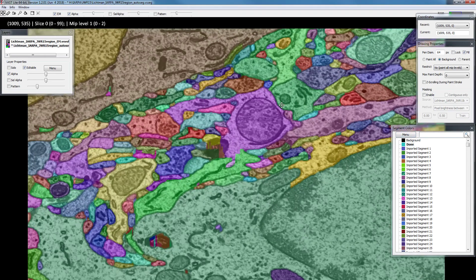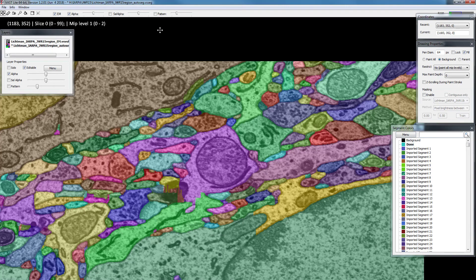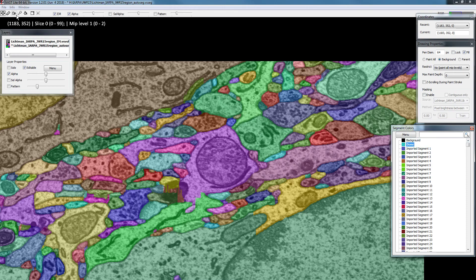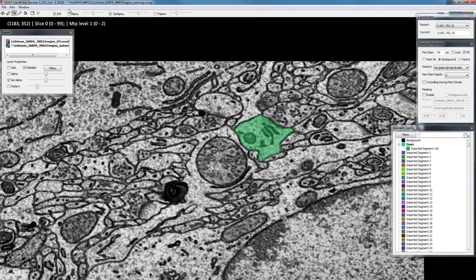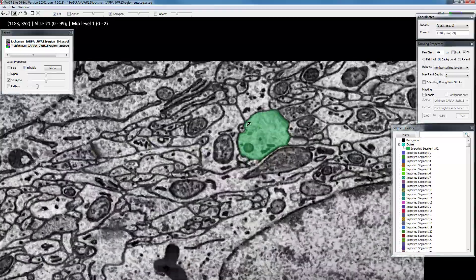To start proofreading, we go in and select some random object — for example this one. One good way to make sure you've segmented everything is to use your done folder. The first thing you do is go to collect mode and collect the segment you want to work with into the done folder by clicking it. You can see it has now been moved into this folder. You can also selectively view only the selected segments or sub-segment tree.